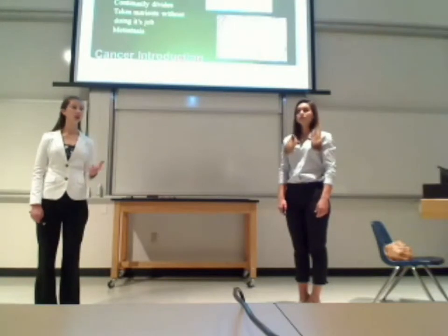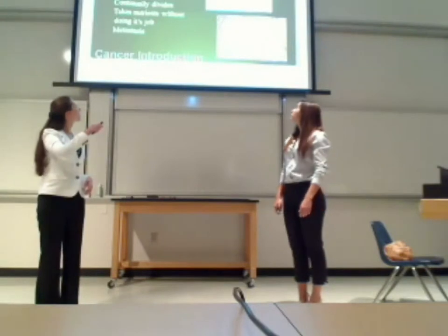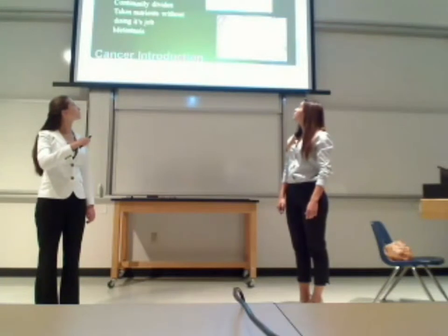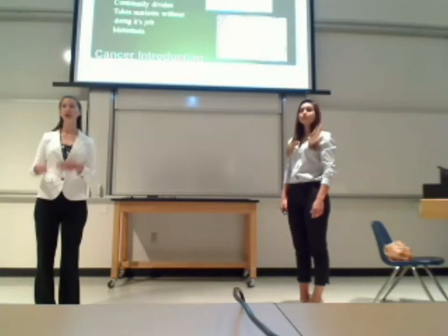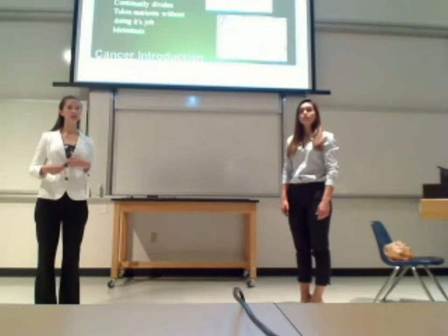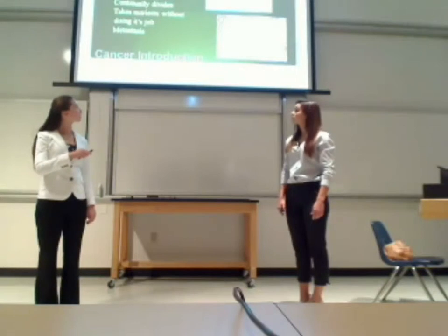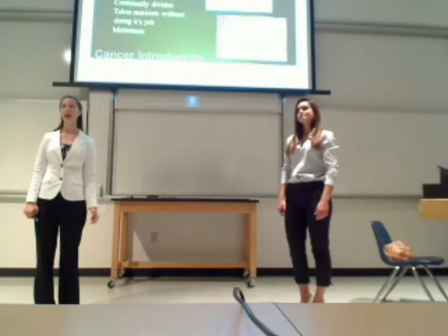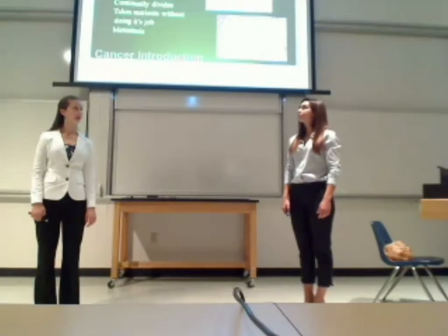Cancer hurts you because it just continually divides. Instead of stopping and staying in G1, which is up there, and doing its job, it goes straight through these checkpoints, which are the red things, which normally tell the cell to stop and do its job and not divide. But in these cancer cells, they just keep going and going and spreading. And when this happens, they don't do their job. It takes too much energy from the body to cause this problem. Also, these are colon cells, and the dark purple that you can see are the nuclei of the colon cells, and they're really irregular because, again, it's dividing so quickly.